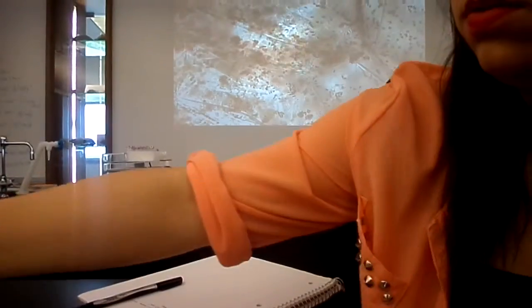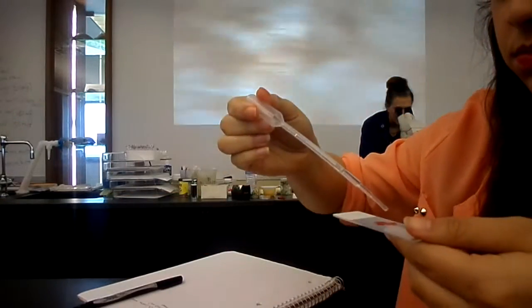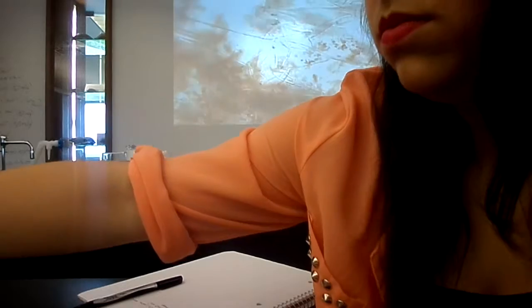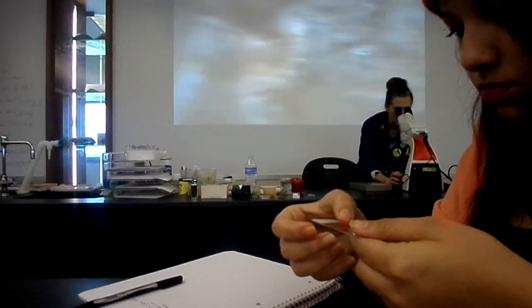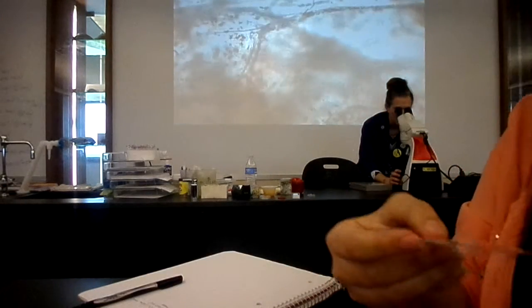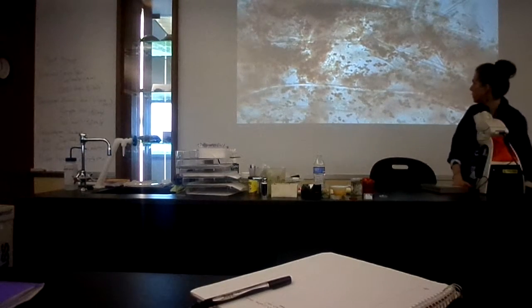One little cell that I can look at. So, as far as our review goes, which one are we looking at? Yeah, it's the first one. Okay, it says tomato, but we're looking at bell pepper instead. Is it going to be the same with the structures and stuff like that, though? Yep, we're just changing the fruit. Okay, that's all we're doing.